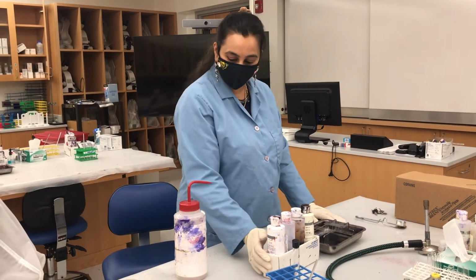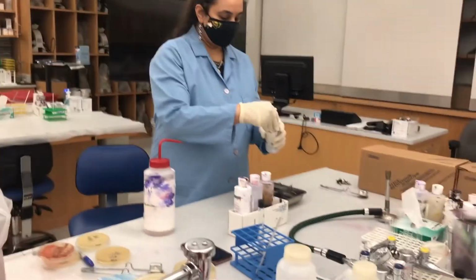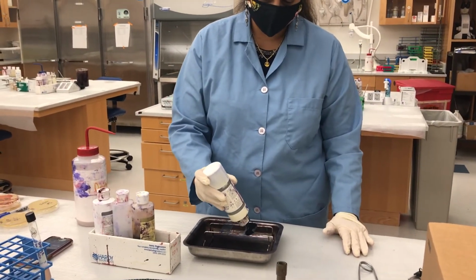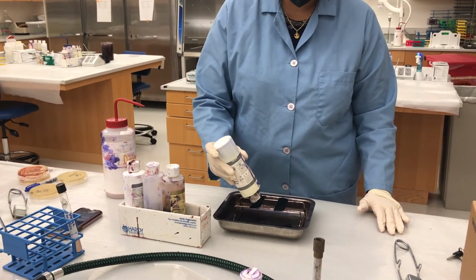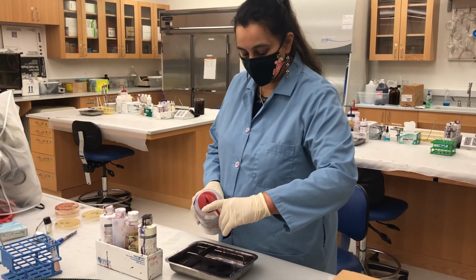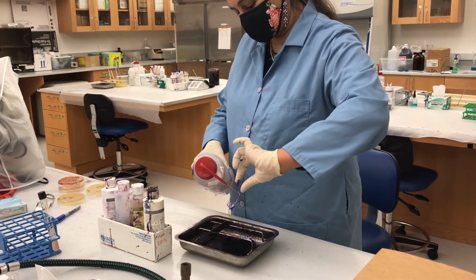We have the timer, we have the reagents, we have the distilled water, and we have the smears all ready. So you add the primary stain, completely cover the slide using the primary stain and start the timer. Leave the stain on for 1 minute and then wash it nicely by holding the slide like this, and wash it front and back with distilled water.